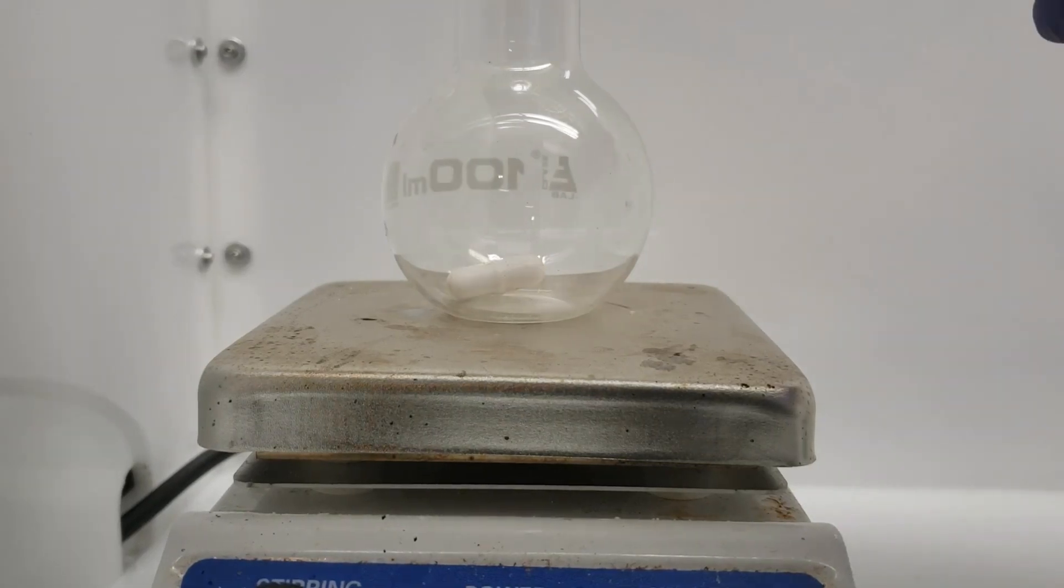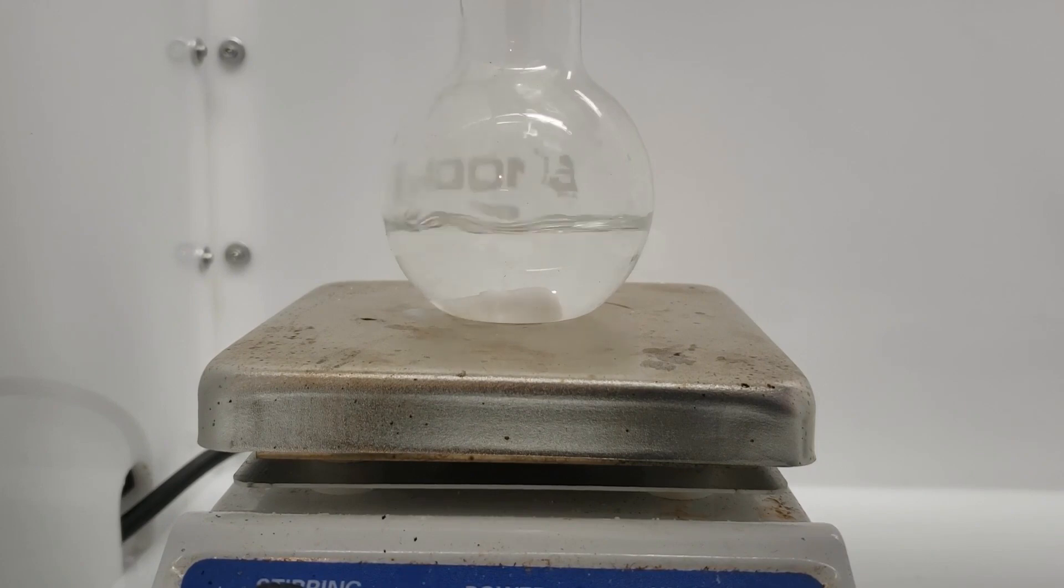Next, 15 milliliters of 20% hydrochloric acid was measured out and added to a 100 milliliter round bottom flask, and then the Praseodymium metal chunks along with it.